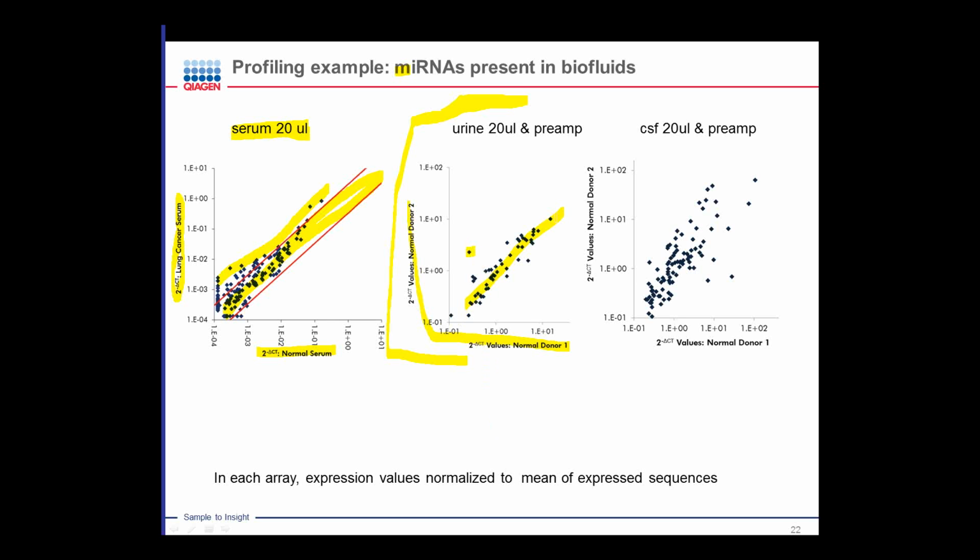So what this suggests is that these are microRNAs in the non-cellular fraction of urine that are shed under normal circumstances by the cells that line the urogenital tract. And that's a pretty acceptable explanation. You could imagine that if one of these people had a prostate tumor or a bladder cancer, you would certainly see a change in the expression profile of microRNAs in the urine.